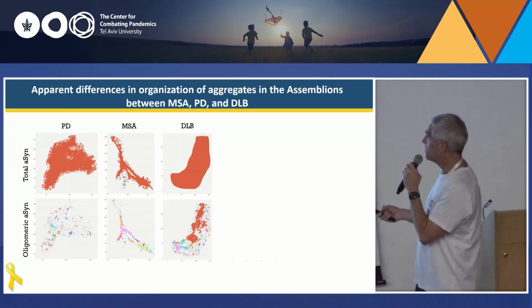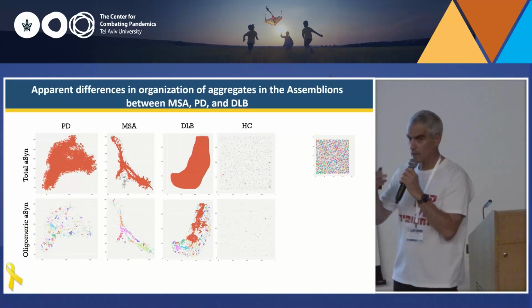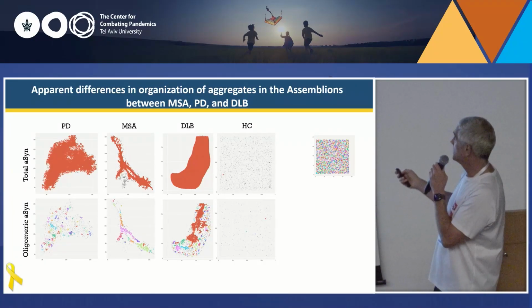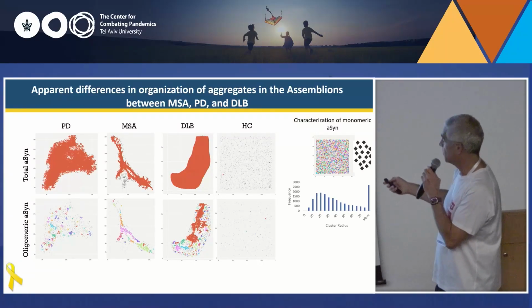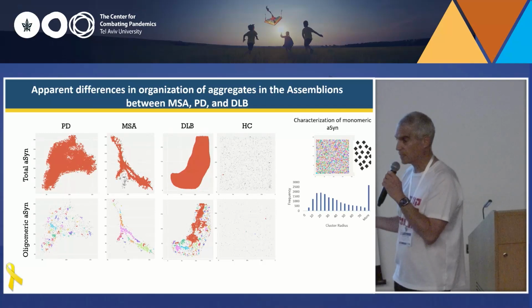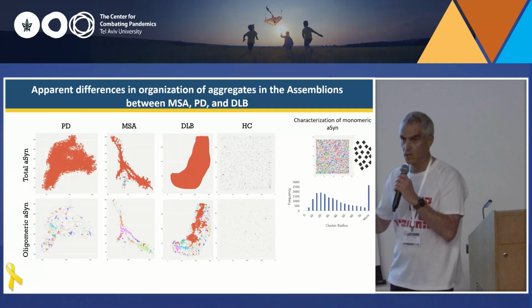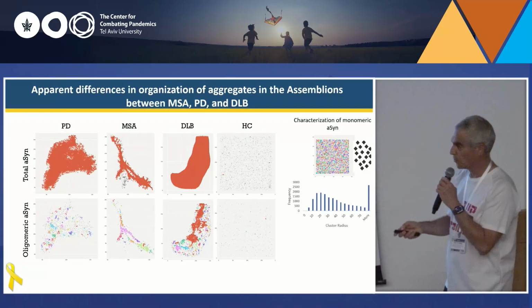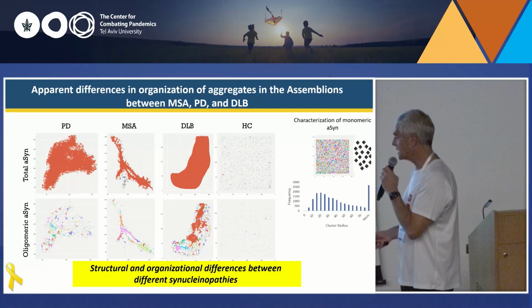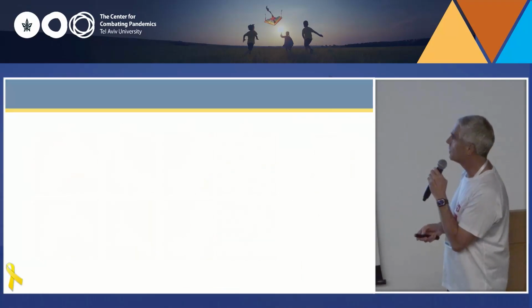In addition, when we looked at the monomeric form of alpha-synuclein, we can identify, quantify, and characterize how monomers look in the system, and basically say that the monomer for us has 20 blinkings, the size is XYZ, and then we can go back to these places and maybe suggest that we have here oligomers of 20 or 30 or more points. So there are structural and organizational differences between the different synucleinopathies, and this is something that we are proceeding with.